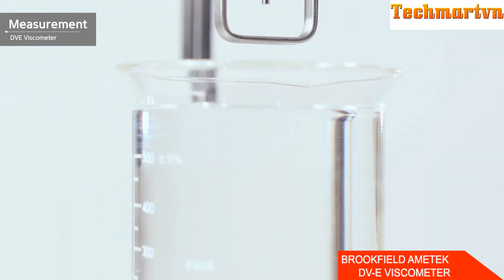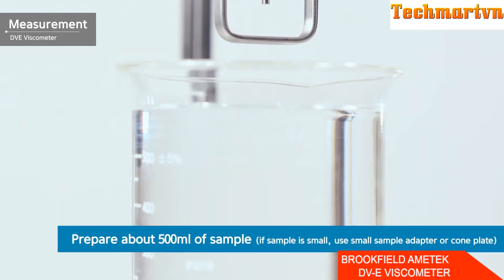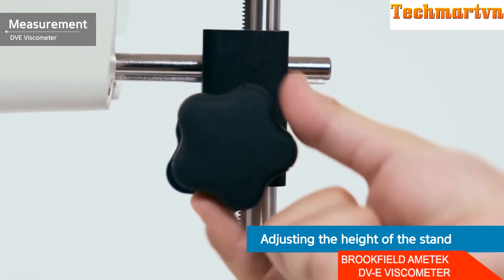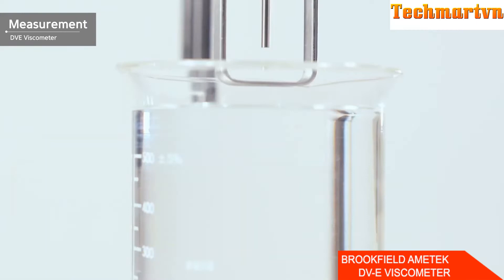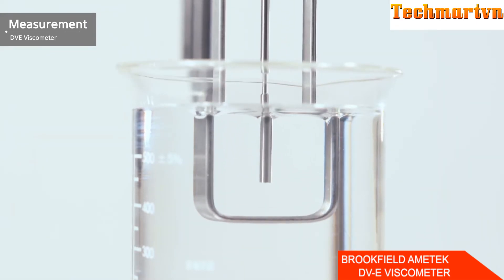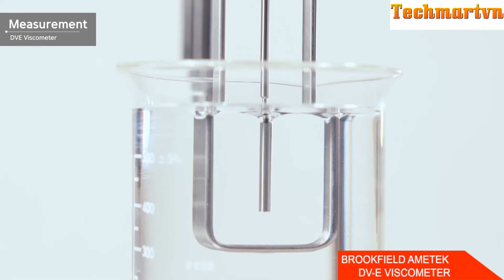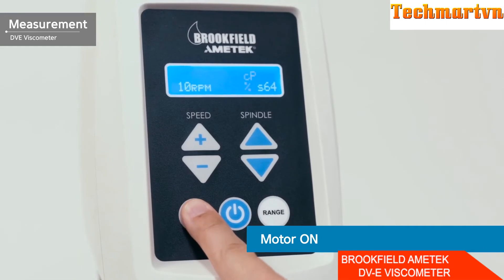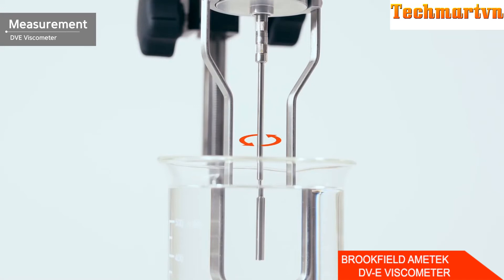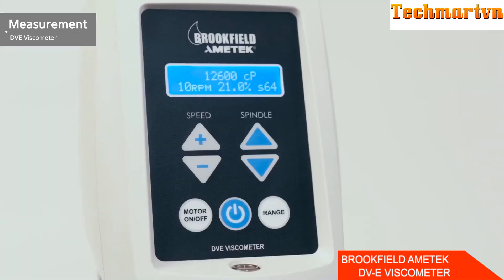Prepare approximately 500 milliliters of sample for measurement. If it is difficult to secure 500 milliliters, use the Brookfield accessory small sample adapter or cone plate. Turn the height control knob to immerse the spindle in the sample to the marked groove, then press the motor on/off button on the bottom left.